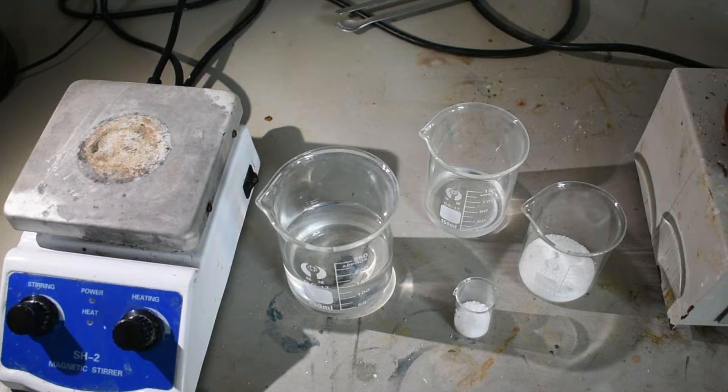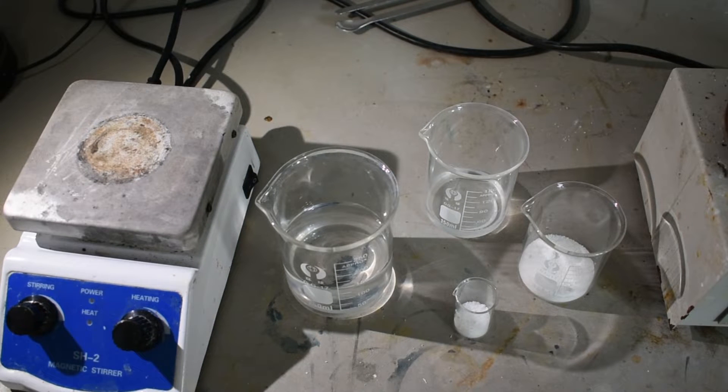We only need three reagents to make sodium perborate: 30 milliliters of 35% hydrogen peroxide, 5 grams of sodium hydroxide, and 24 grams of sodium tetraborate.